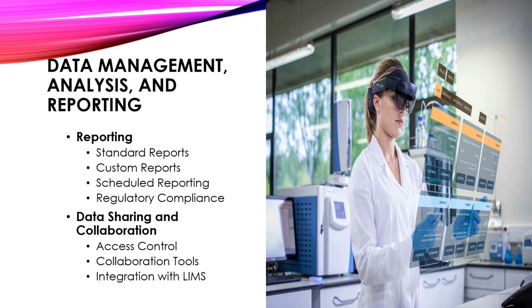Now, custom reports. Users can create custom reports tailored to specific requirements using flexible reporting tools provided by the laboratory management system. And these reports can include tables, charts, graphs, and other visualizations.